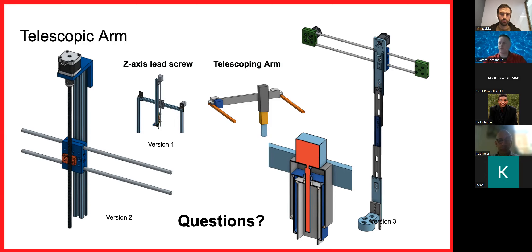My question for the group: has anyone seen anything like a low-budget telescopic arm similar to this? I tried a nesting design — there's a NASA design from years ago shown in the cutaway view — but I couldn't get it to work because of the tolerances needed for the lead screw. Version three is working, though it's not my finest work.